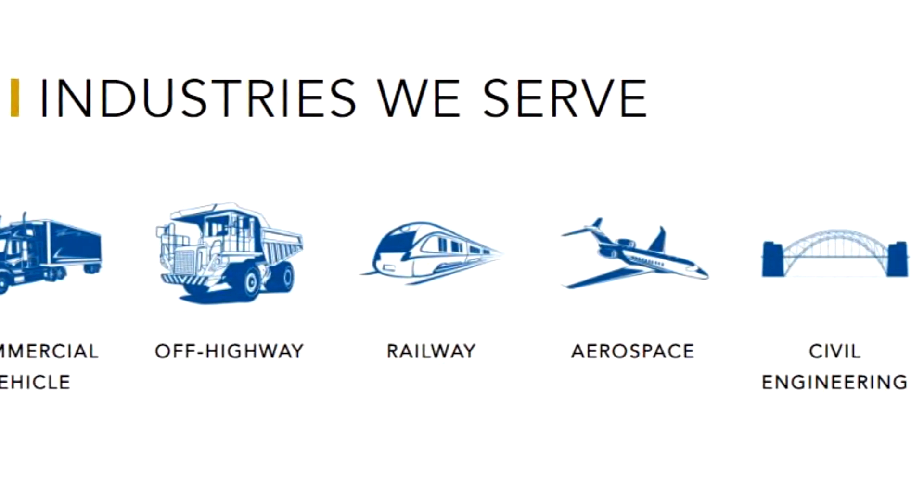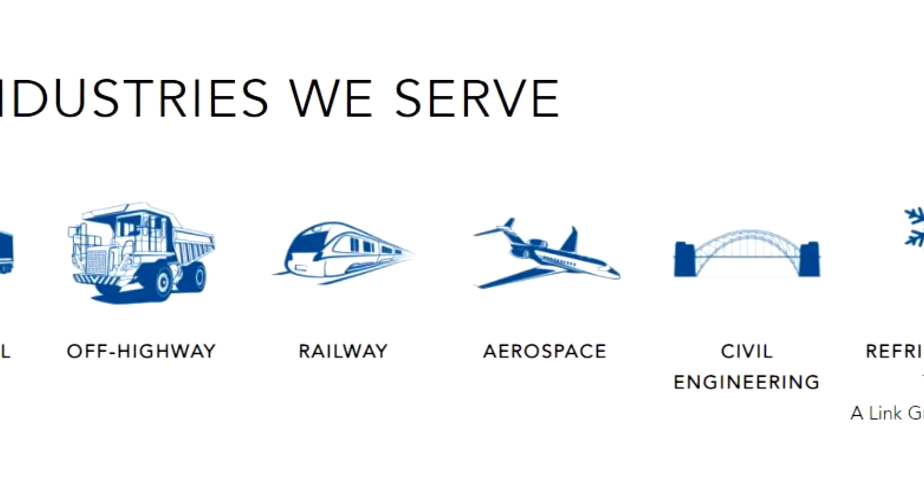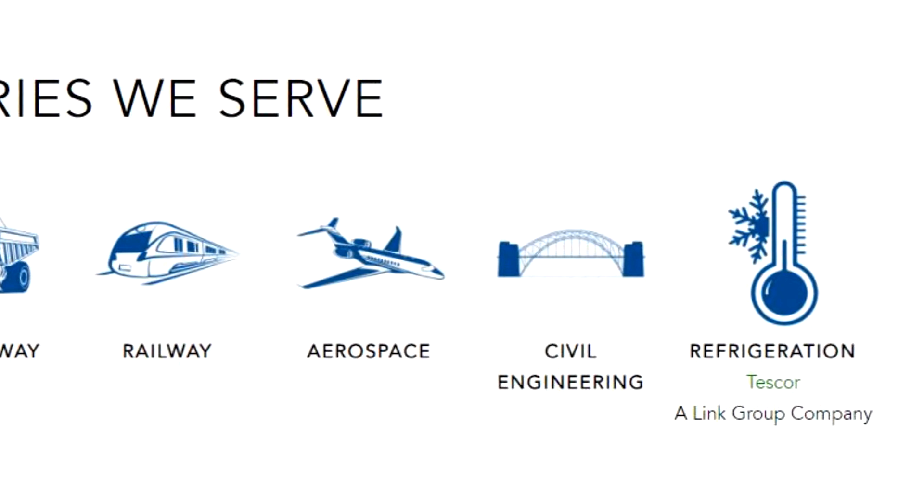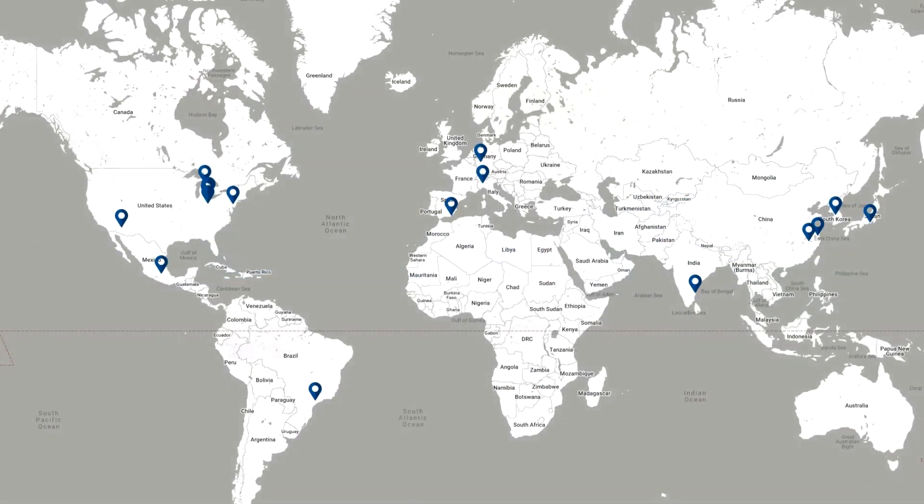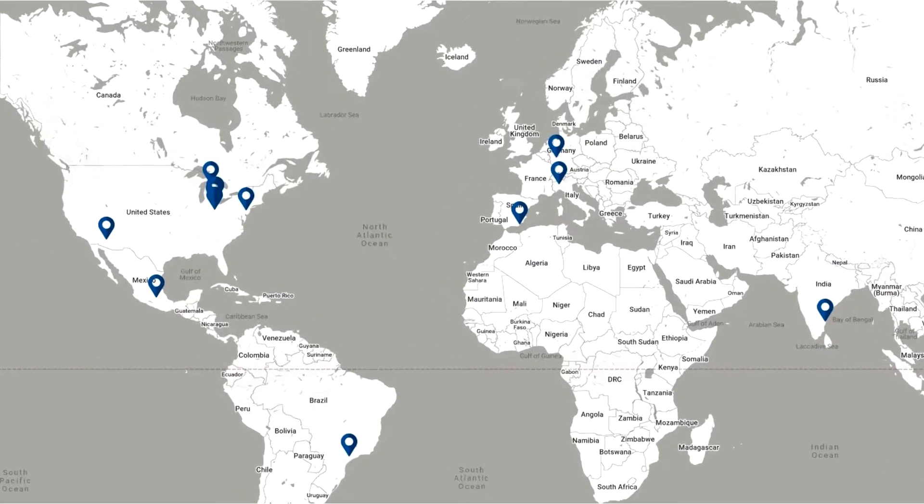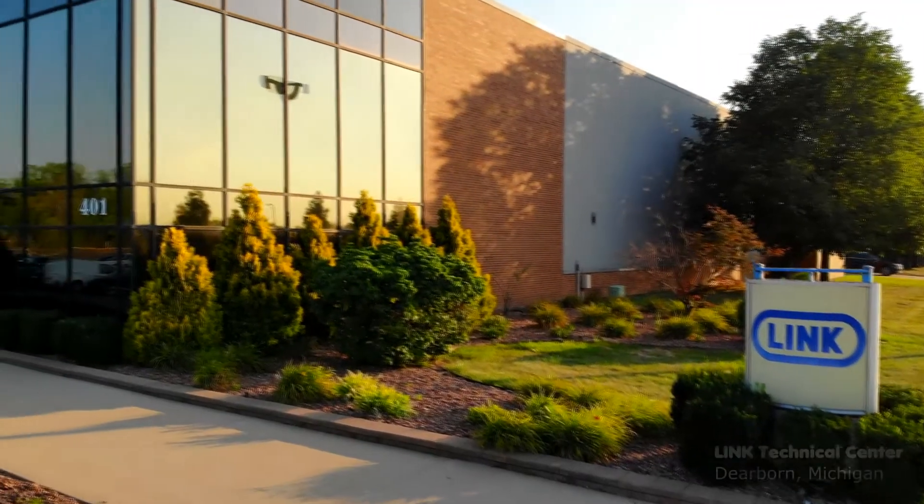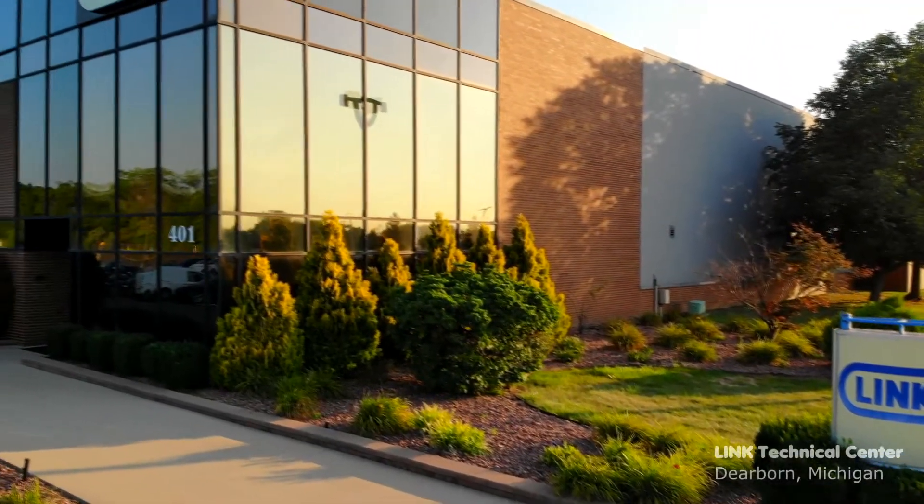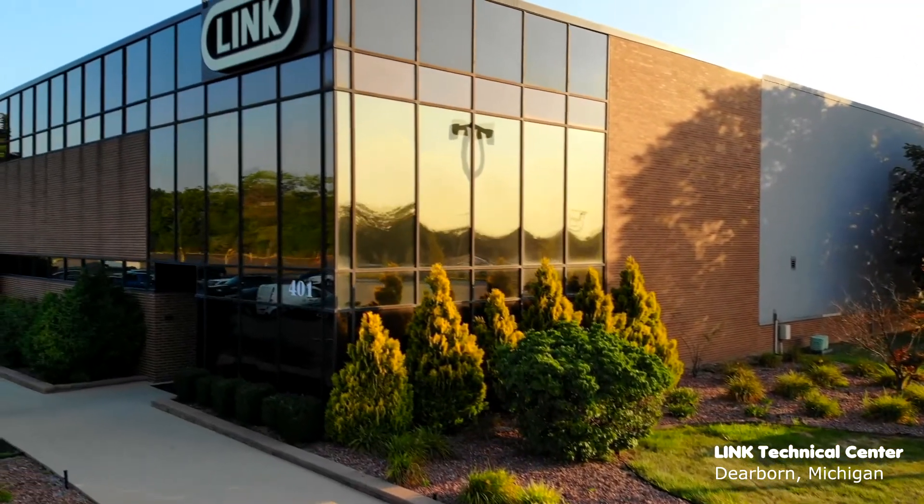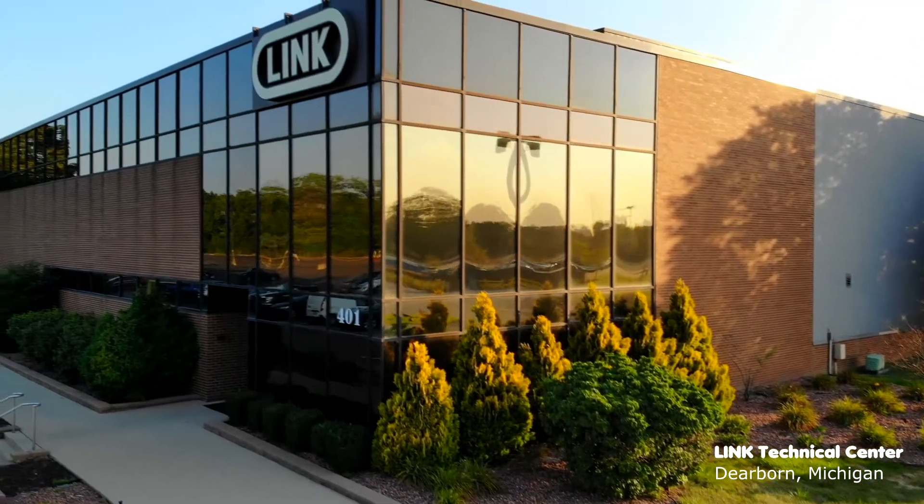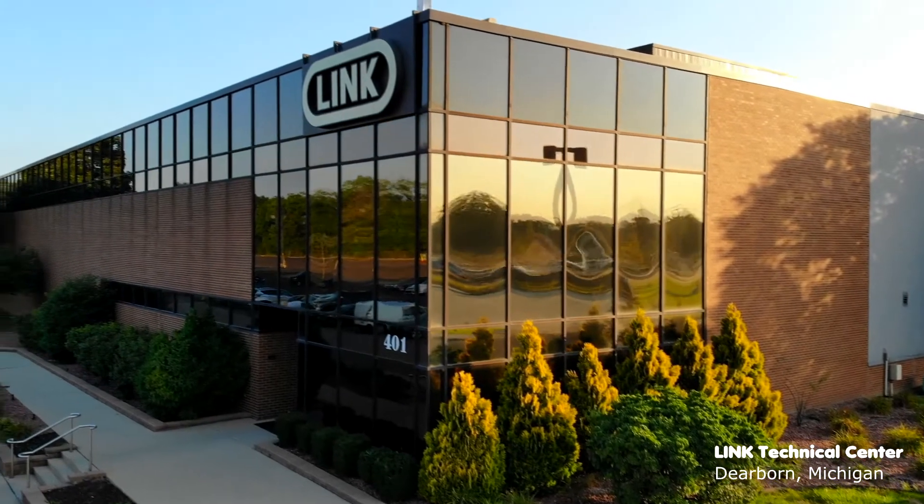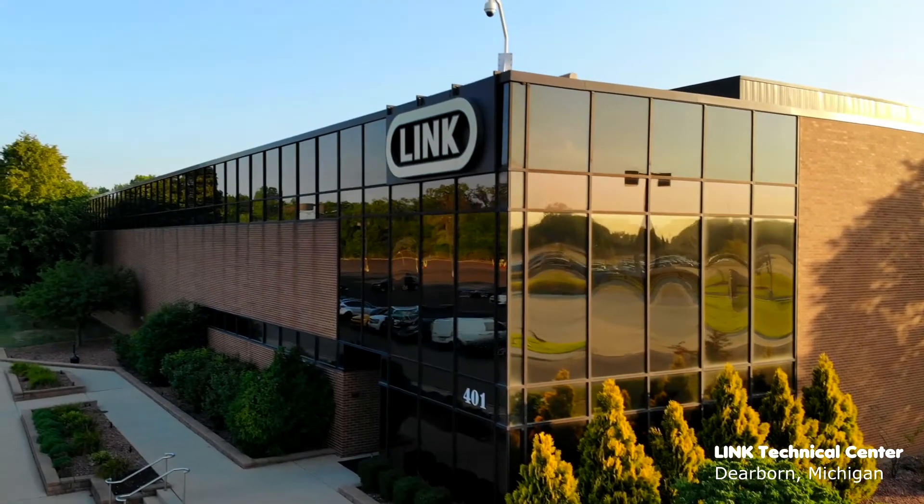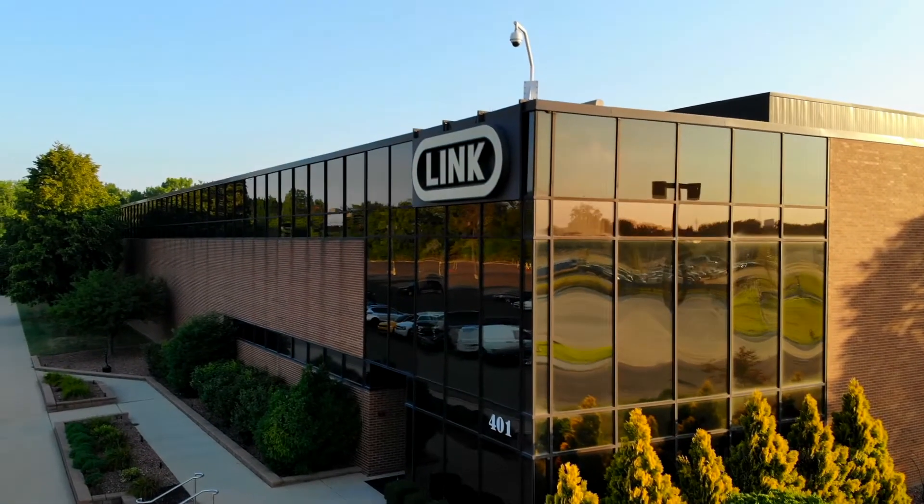Our specialty is creating custom solutions catered to our clients' specific needs. Link operates testing facilities around the world, so we are in need of lab management software that would connect our laboratories to a single system and streamline processes through a common interface.